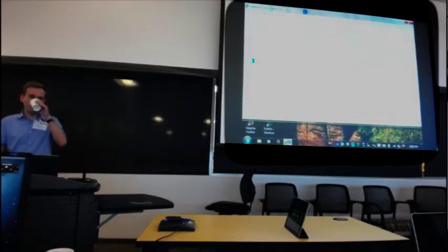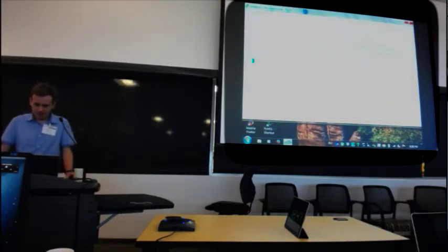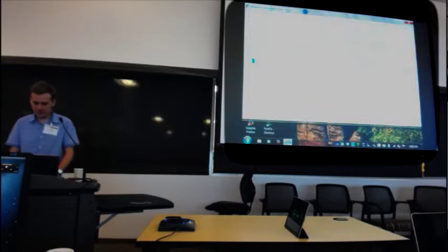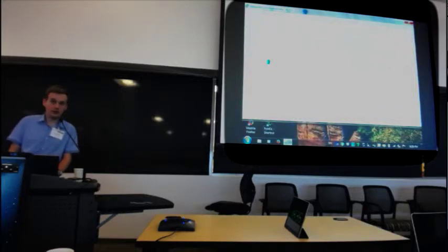In the meantime, you can issue this command and see what your jobs are doing. In my case, they are still running. I said 6 minutes, it's taking 9. It's probably because access to data is slower.